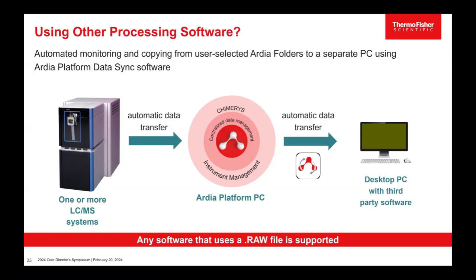So you can have the automation upload those files to Ardia, but you still want to analyze it using Spectronaut or DIA-NN or something else. You can download those onto that desktop PC and run those analyses on that local PC. The Ardia system is a generic file server. It handles Proteome Discoverer results, raw files and sequences, especially because they're our native file formats. But you could copy any result file, any kind of data file you want on that PC and share it just like you would do with OneDrive.